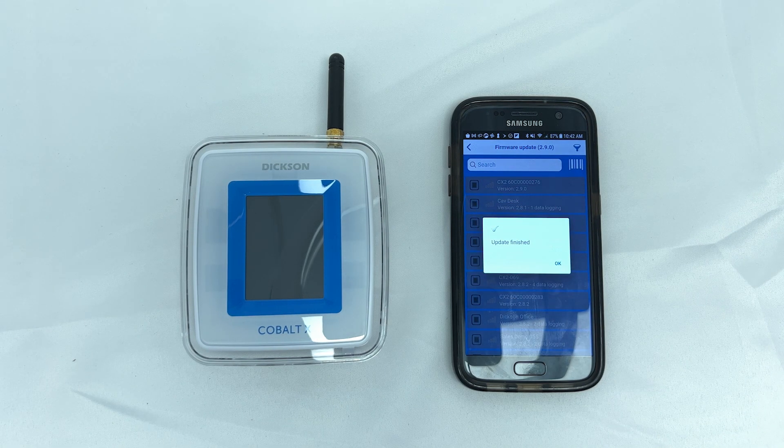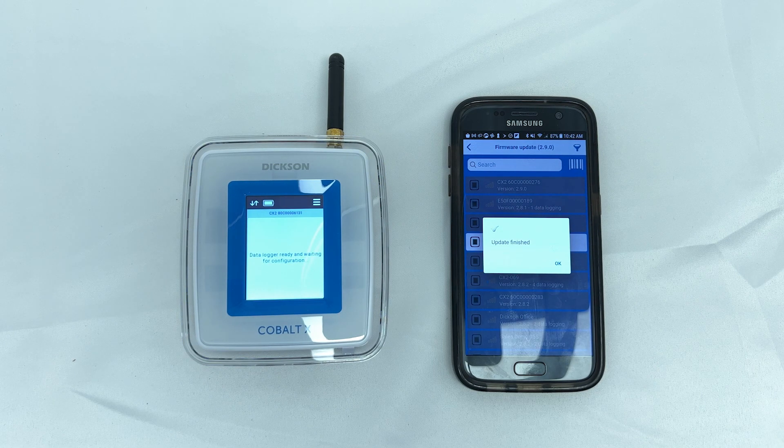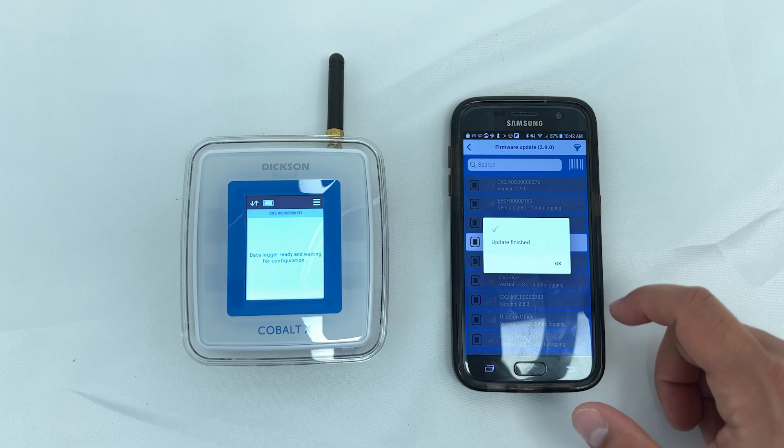An update finished message will then appear, and after a minute, the Cobalt screen will turn back on. The firmware has been successfully updated.